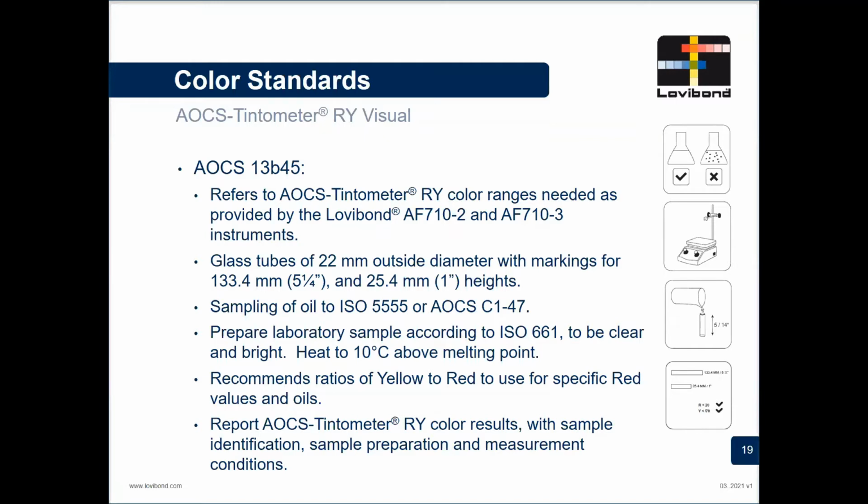Again, when we come to report the results, as with the Lovibond scale, we're putting down our red-yellow values with some sort of sample identification, some sort of preparation, and our measurement conditions.